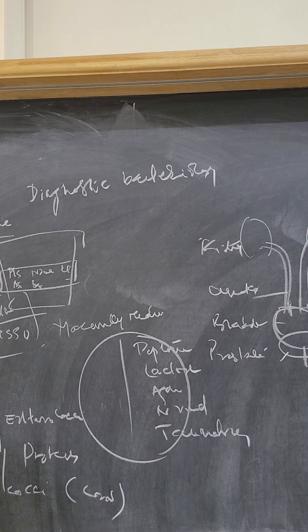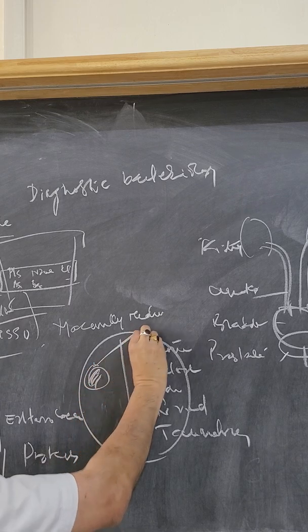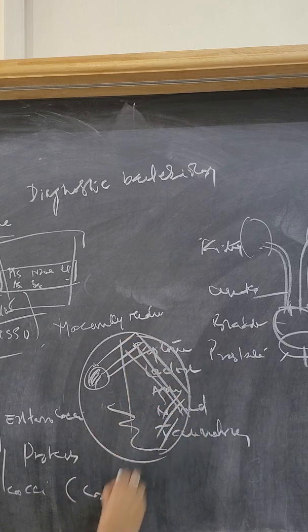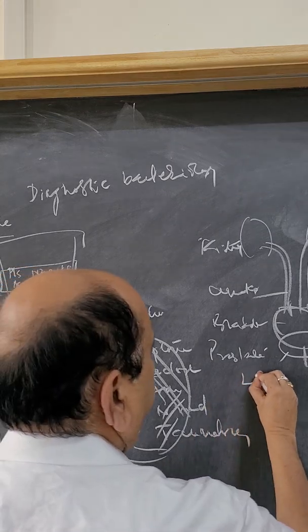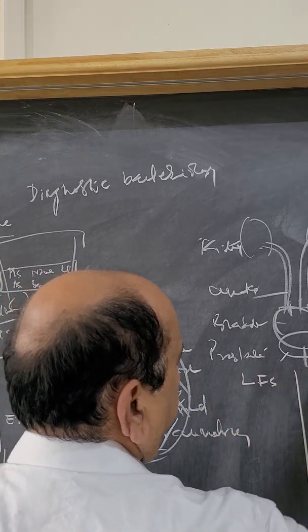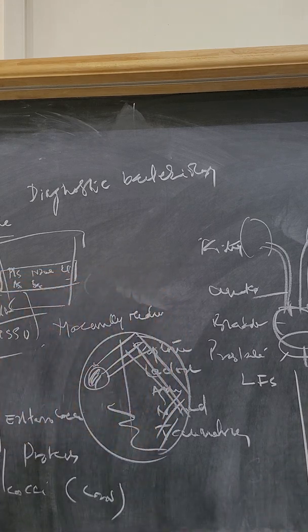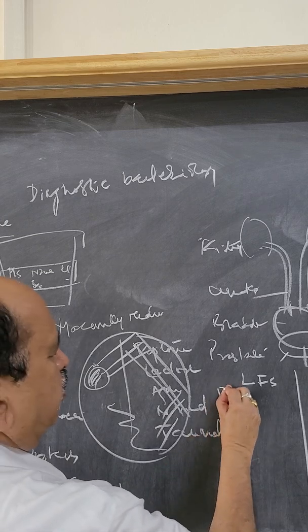These organisms cause urinary tract infection. We plate the sample onto the plate. Depending on the colony, they are classified into lactose fermenters and non-lactose fermenters. Lactose fermenters ferment lactose, and the colonies are pink in color.